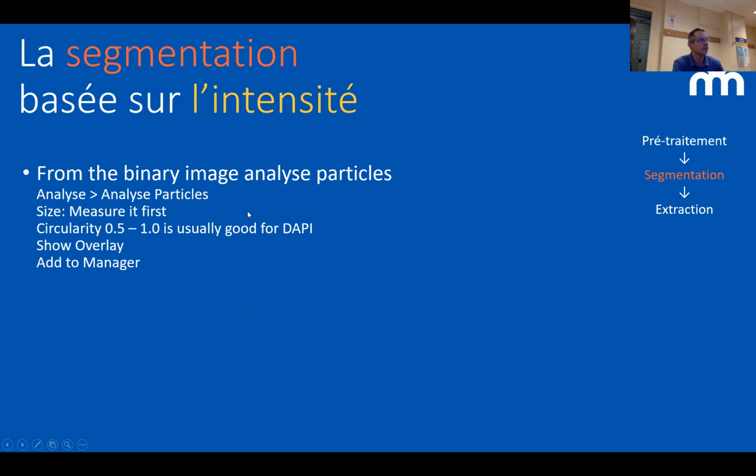And one of the things that most people are interested in is actually counting particles. In ImageJ, in your binary image, you can go and do Analyze Particles. And what this is gonna do is show you a pop-up window where you can select different features. And based on this picture, the software is gonna count things for you. So in my image, the question is, how many cells do I count? And the question you can ask yourself is, how many cells did you count? So I'm gonna share my screen.